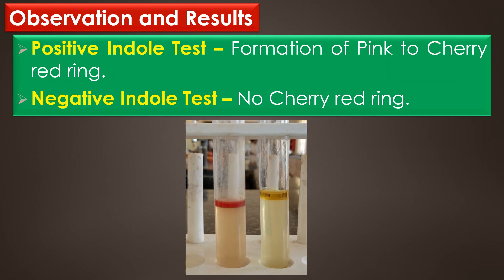Observation and results: A positive Indole test shows the formation of a pink to cherry red ring, and a negative Indole test shows no cherry red ring. This tube shows the positive Indole test — the formation of a pink to cherry red ring — and this tube shows the negative Indole test, with no cherry red ring.